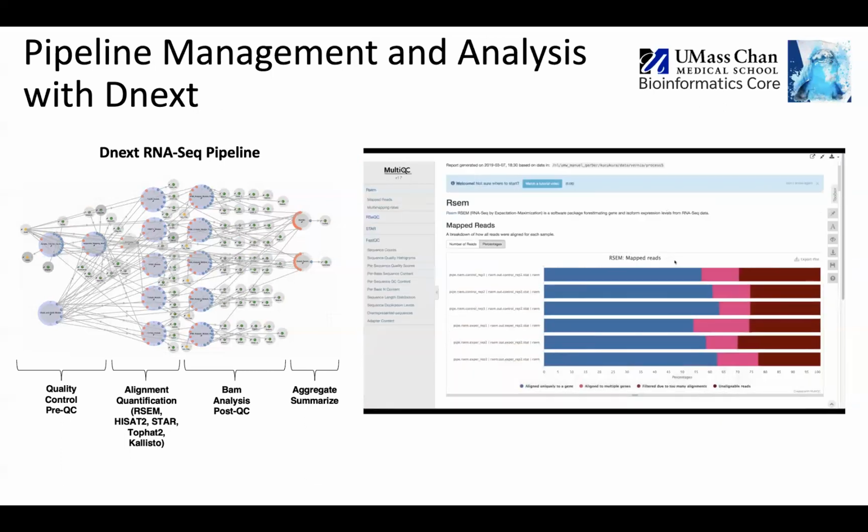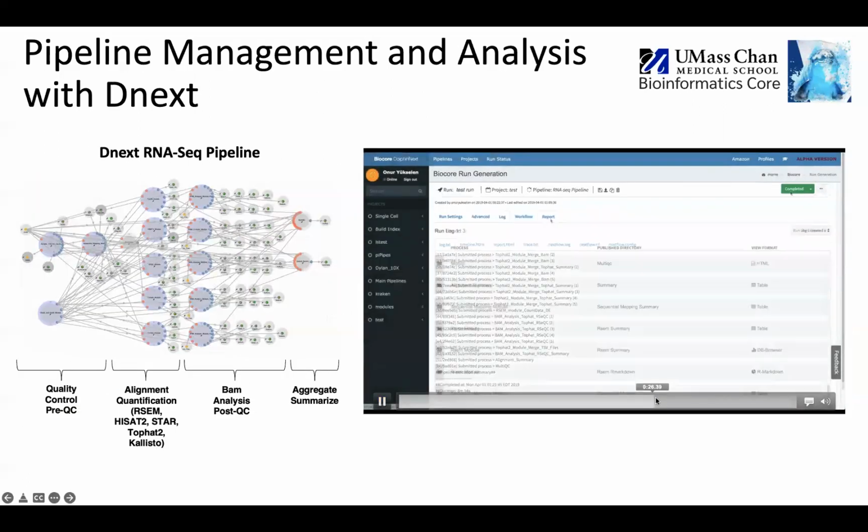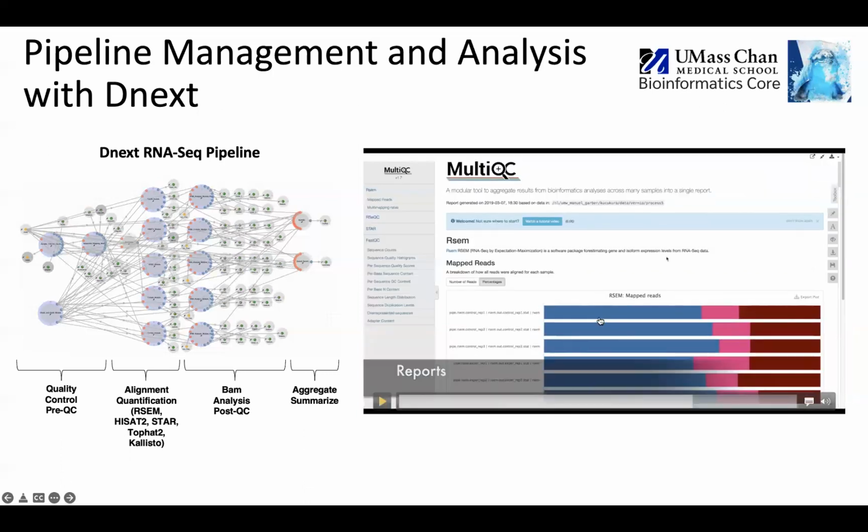For example, you can check this MultiQC, all the QC results. This is important. The first thing you do when you run RNA-seq data, for example, or ChIP-seq, ATAC-seq, any sequencing, is check the quality of the reads. And there are lots of QC checks here. These are alignment qualities, like what percent map to genomic regions, what percent are multi-mappers, what percent are unique mappers, those kinds of things. If there's something wrong, you can see it in these plots.